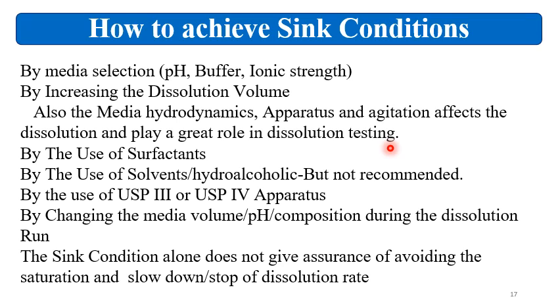Then we can change the media volume, pH, composition during the dissolution run. That is sequential change in the media. Once the media gets saturated, then you can change the media or you can change the composition or pH of the media, and like this you can achieve the sink conditions. The sink condition alone does not give the assurance of avoiding the saturation or slow down or stop of the dissolution rate.